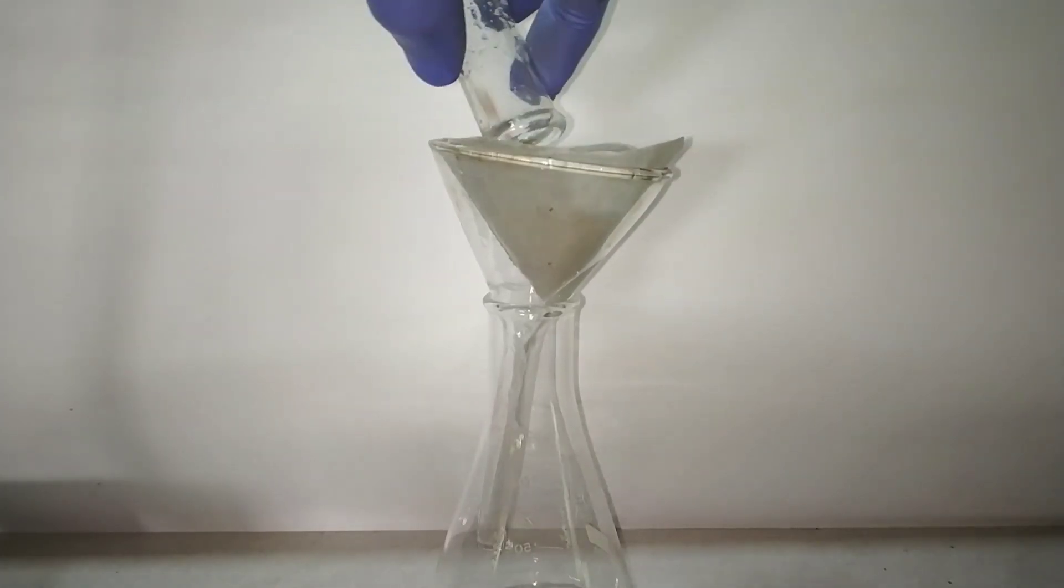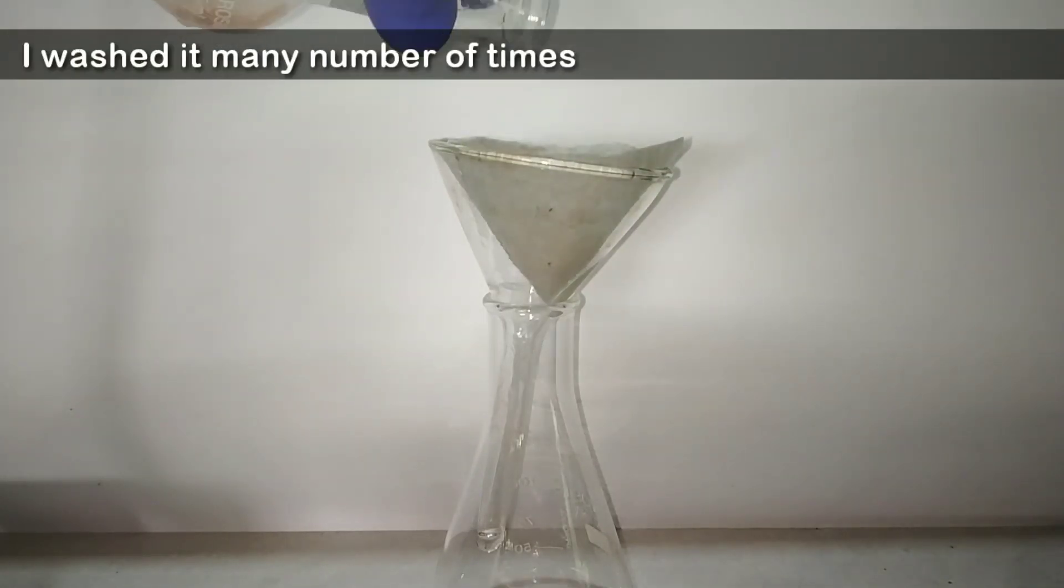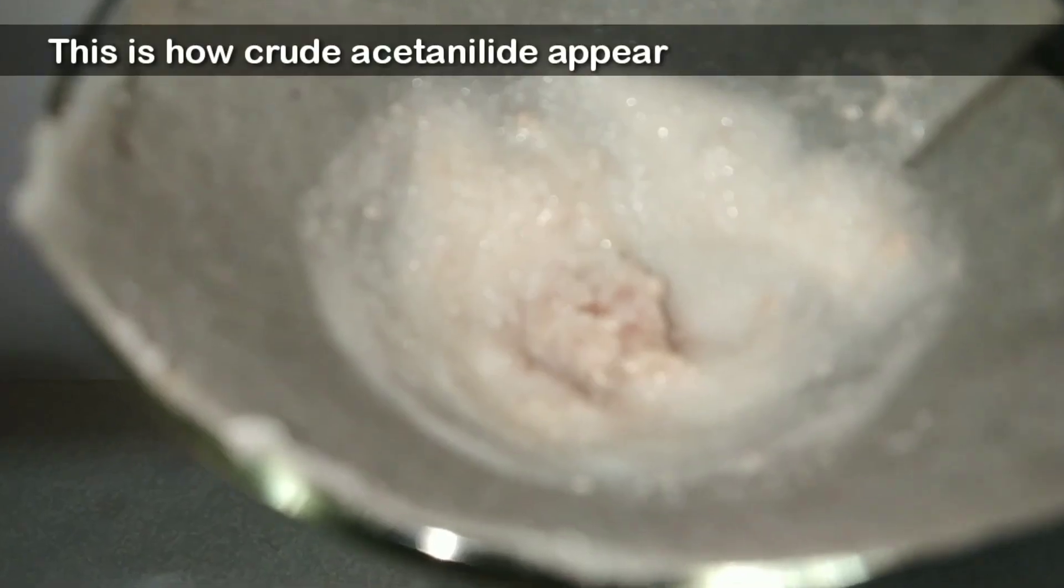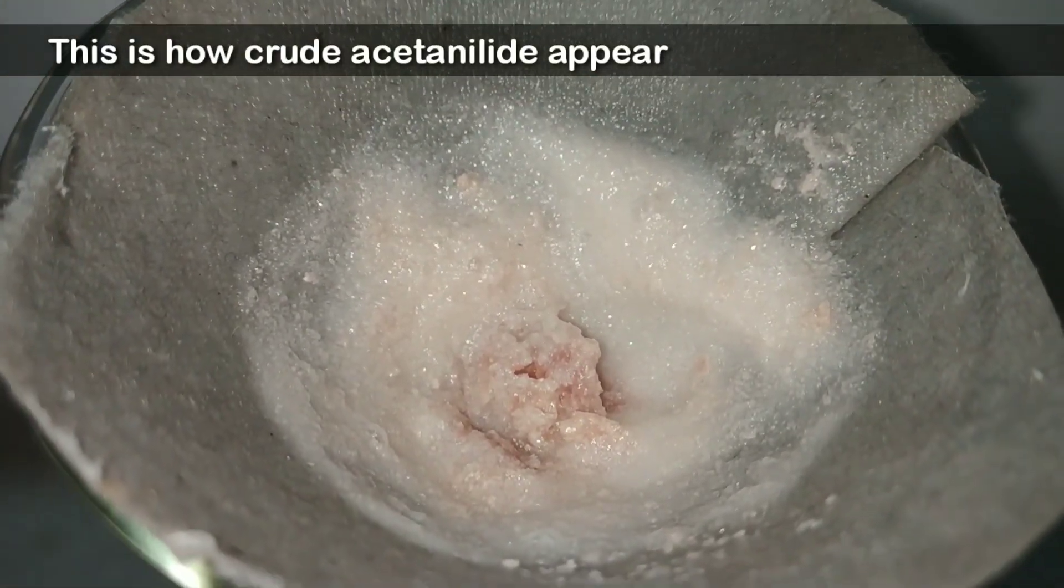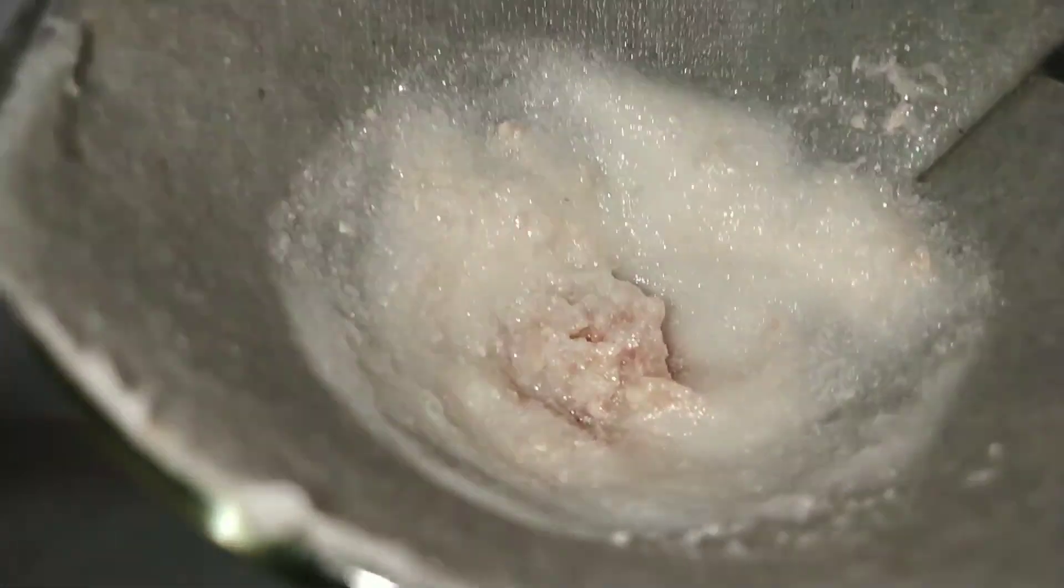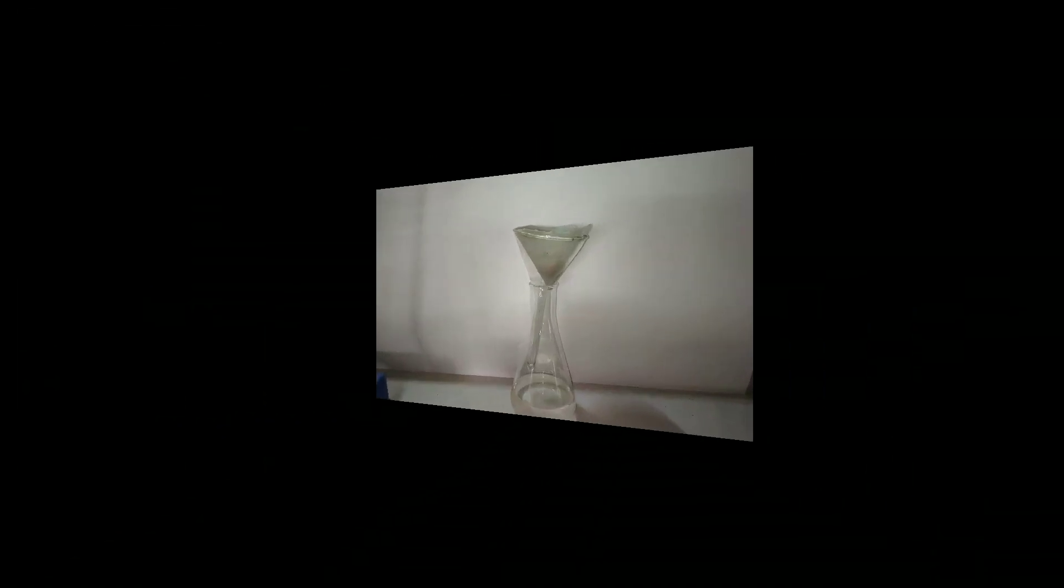Now I am washing the flat bottom flask with ice cold water and pouring the solution into the filter paper so that I can collect the organic compound that is stuck onto the flask. And this is how the crude acetanilide product appears. You can still see the reddish brown color. And I washed again with ice cold water.